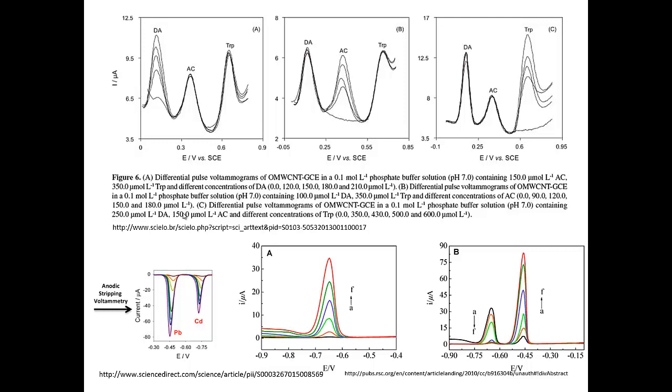Or down here at the bottom, anodic stripping voltammetry, and that is where you apply a potential that causes the species to deposit on the electrode surface, and then you apply a different potential and it causes you to strip away that chemical species. What's really cool about both of these techniques is they can be parts per million or parts per billion sensitive, which makes them extremely sensitive techniques that are really good in things like wastewater treatment analyses. But that is all.